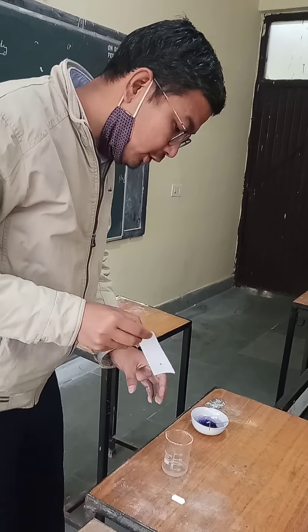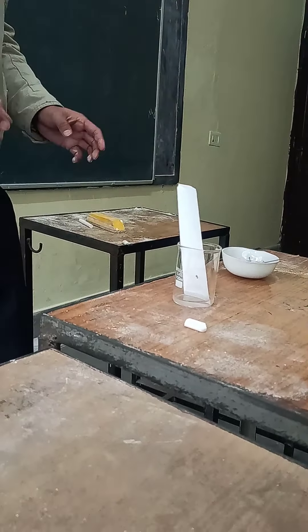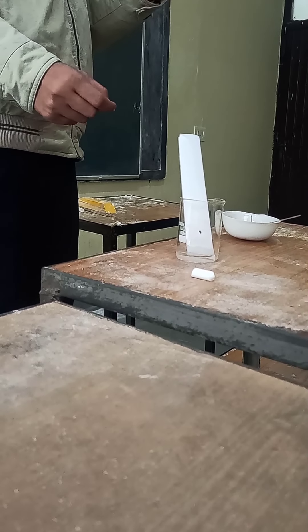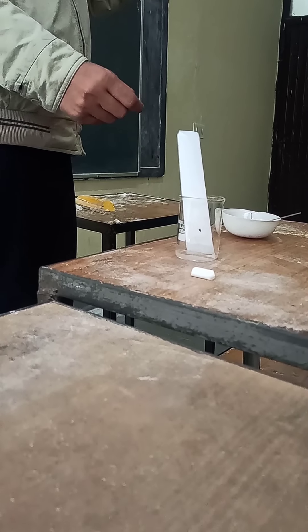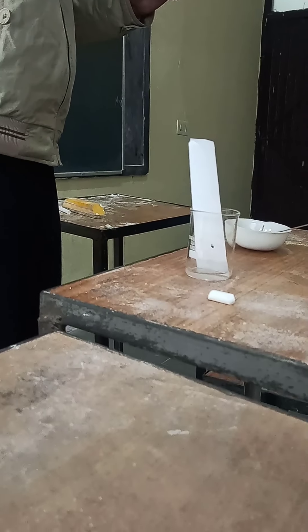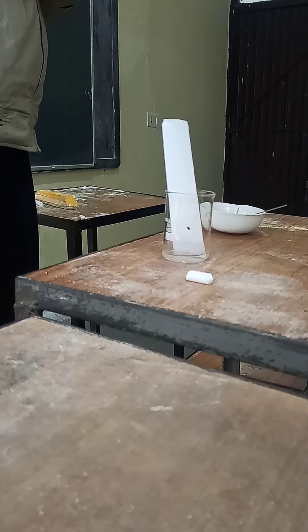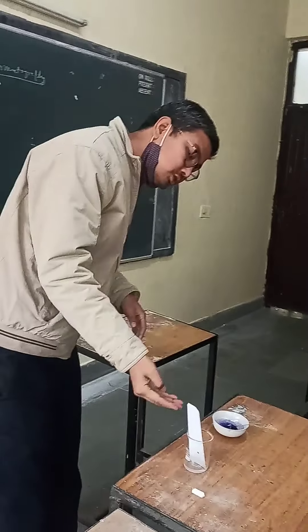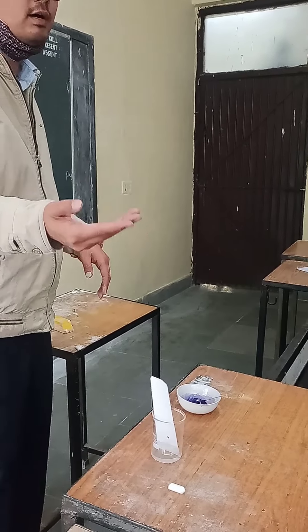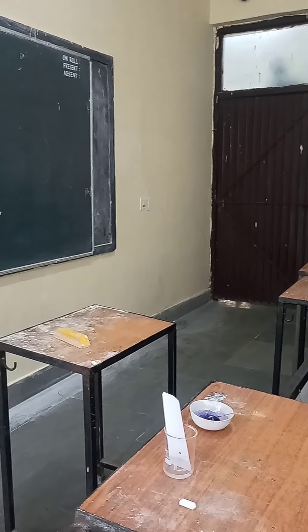Now put the paper in the solvent chamber. Always take care that the solvent does not touch the baseline — the solvent level should lie below the pencil line. Otherwise your drop will spread out. You will see the solvent is rising slowly; it takes about one hour.